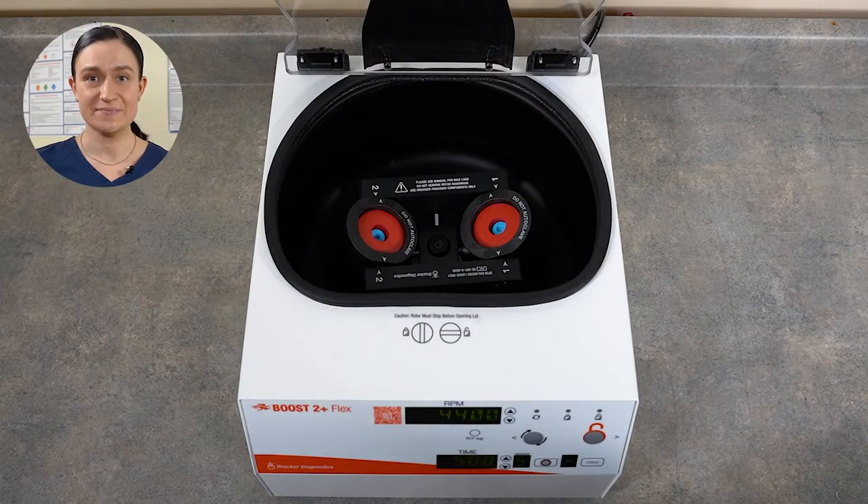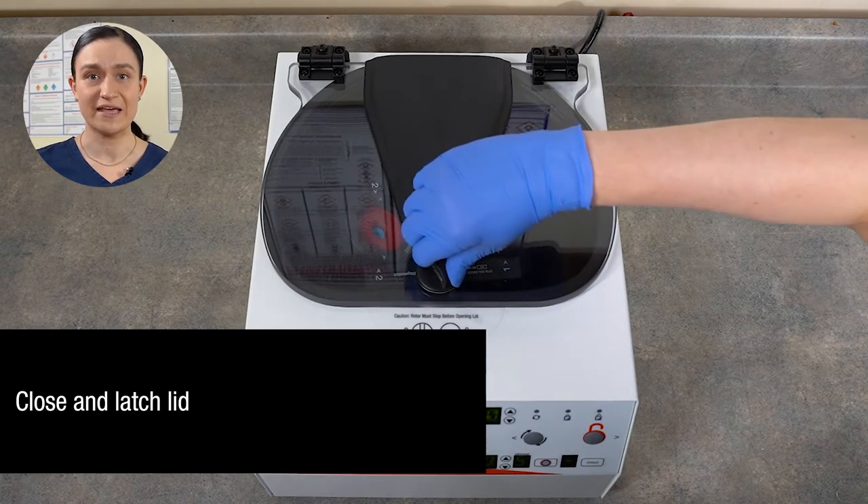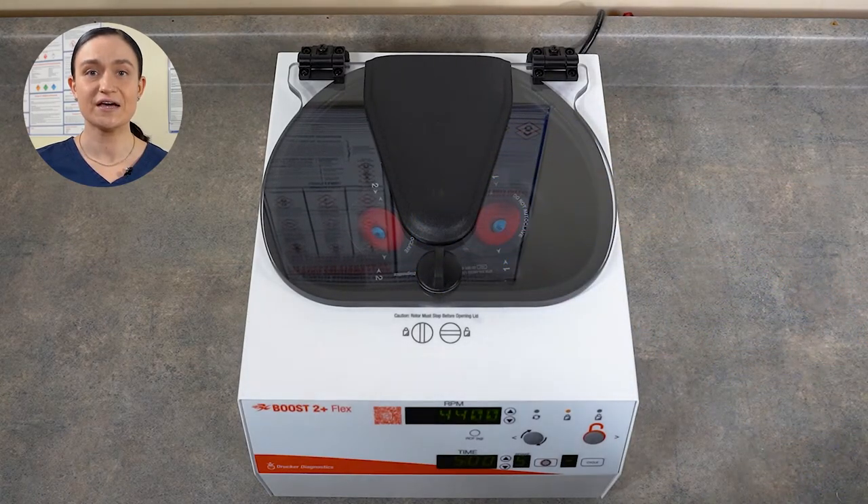With your buckets placed, your inserts if needed inside them, and your tubes or tube and counterbalance in place, you're ready to spin. Close the lid. Secure the lid latch by pressing it down gently and turning it a quarter turn clockwise.